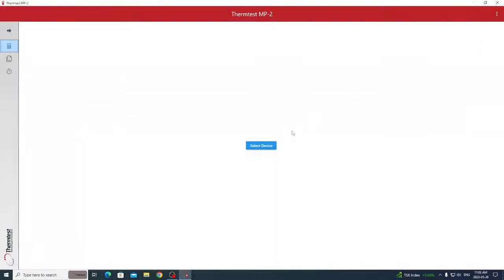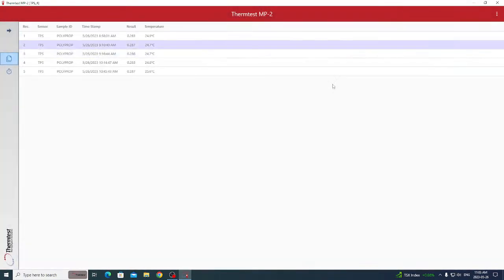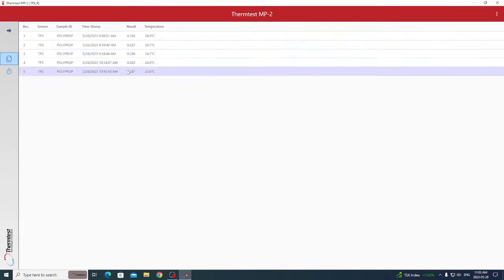Once you open the MP2 software, it will prompt you to select your MP2 device. Select the one connected to your computer, and all your previously measured data will automatically appear, showing the thermal conductivity results as well as the temperature at which each measurement was run.